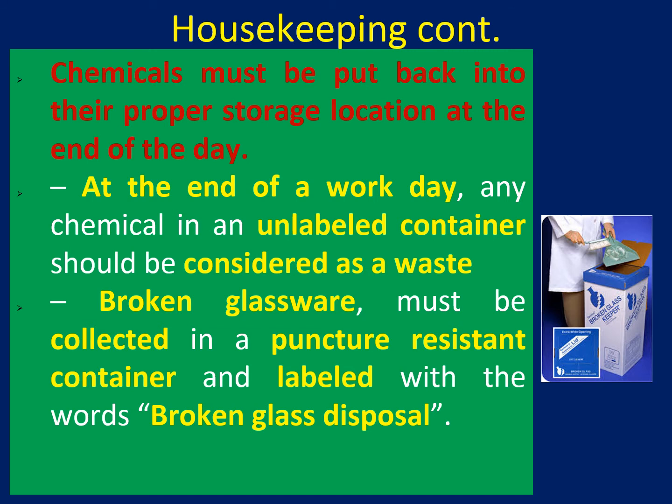And broken glassware you need to put into the broken glassware container. Unfortunately we don't have this one at the moment. We are going to buy this one in the future, and then we will keep it inside the lab.